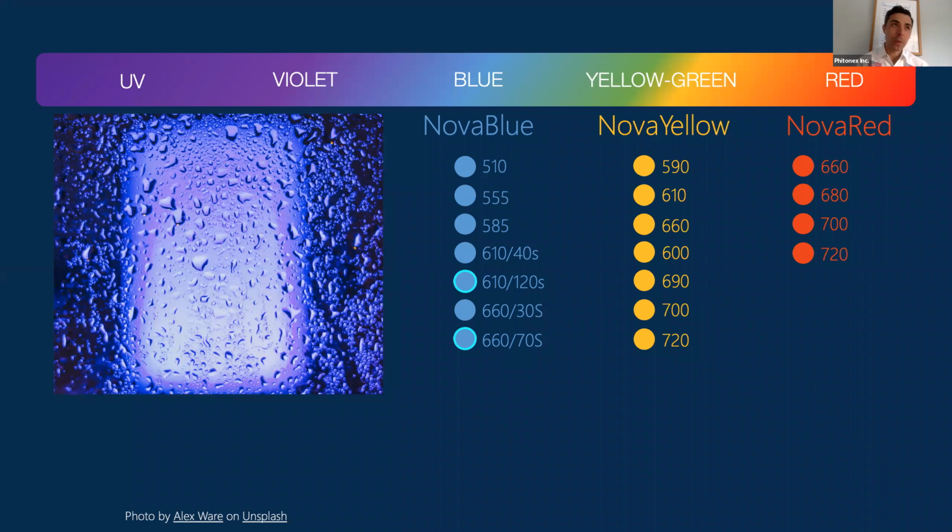Because when we land in a laser line, it's not like, oh, here's one label. We land with the intent of building out a whole suite of labels. I think what we're trying to understand is what brightness, what wavelengths, and what practical considerations too, beyond just the 2-hour master mixing. Aggregates are another issue for these dyes, and we certainly have never seen anything like that. But all that's incredibly useful for us.